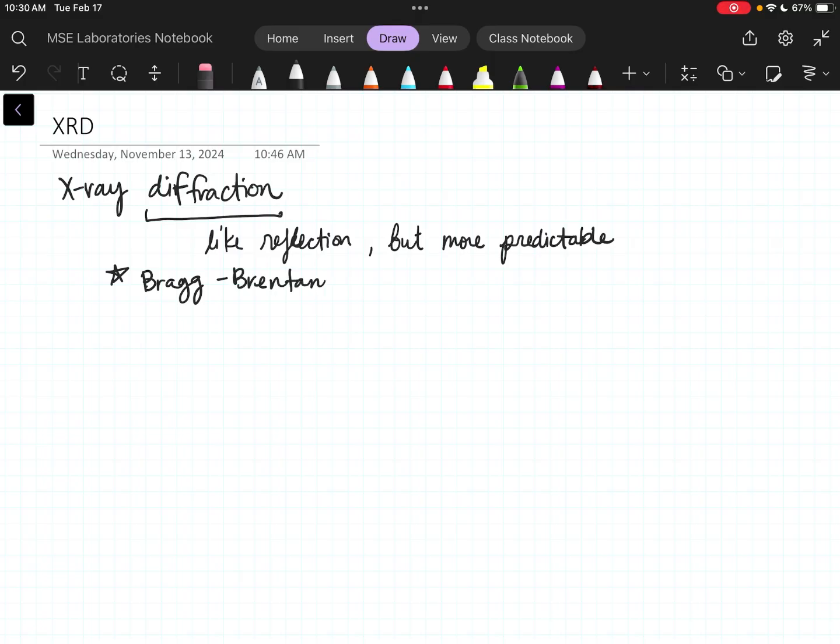And in this discussion, I'm going to be focusing specifically on something called Bragg-Brentano orientation. Have you heard those words before? This is more commonly referred to as powder XRD.